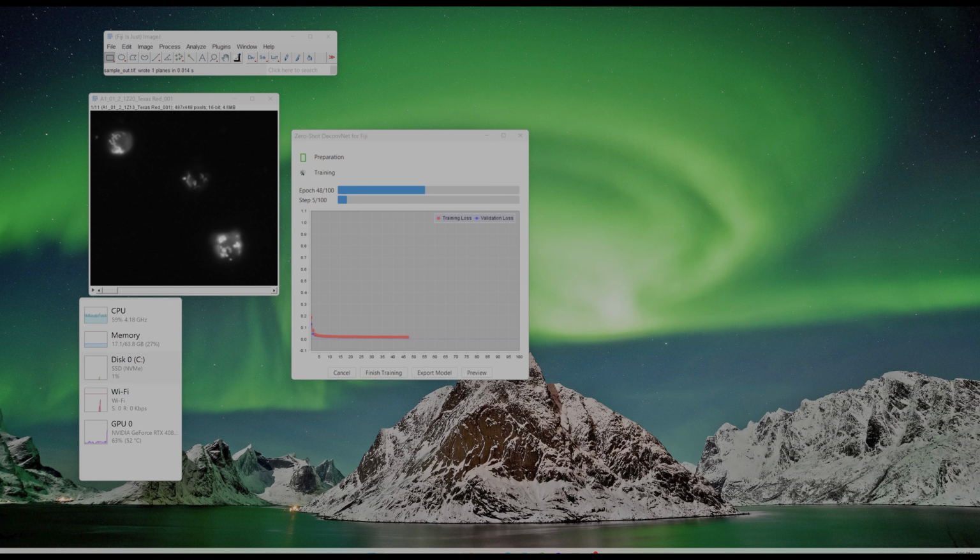All right, the training is going pretty well, and I think I will stop it here. The losses have pretty much plateaued, and should be an okay model. It's not going to be the best, but I already have another model trained, and I don't need this to be the best.